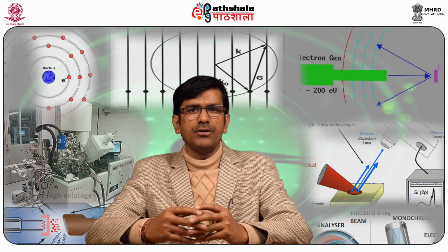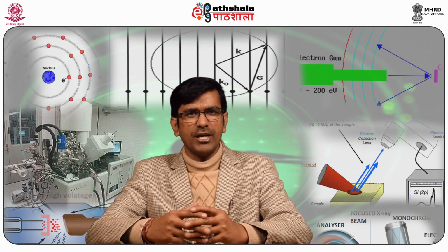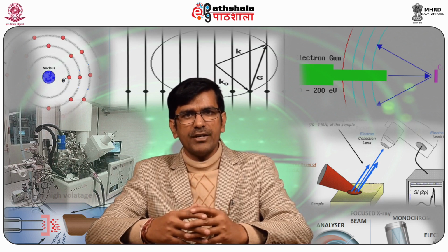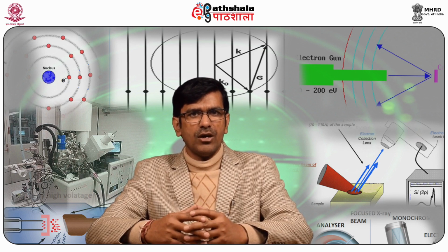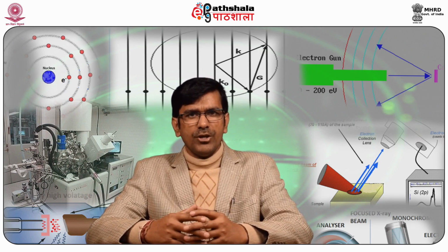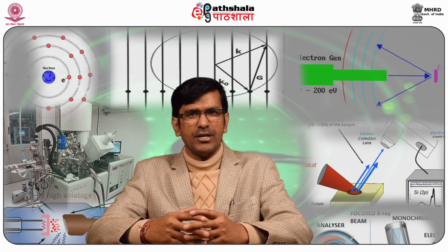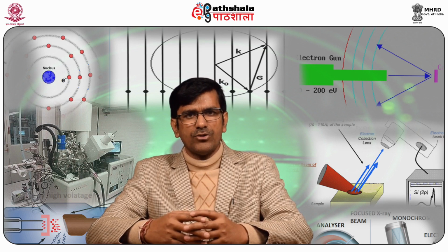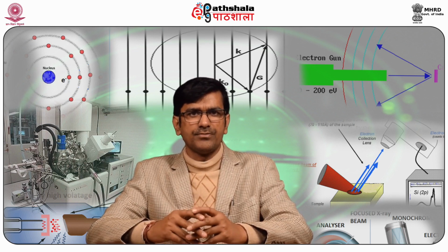Monochromators will be coupled to higher energy X-ray sources, that is about 3 to 10 kilo electron volt, so that studies can be made at lower surface depths without undue loss in resolution. Synchrotron radiation should come into its own, and studies will be possible over a large continuous range of photon energy, that is about 10 to 10,000 electron volt, with good resolution.